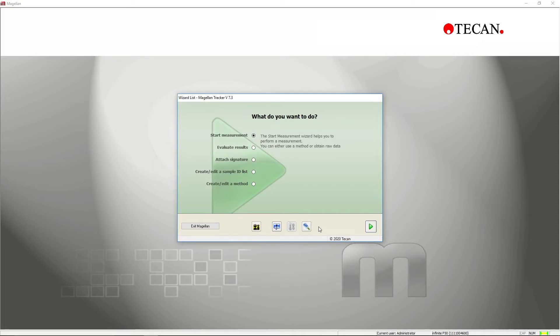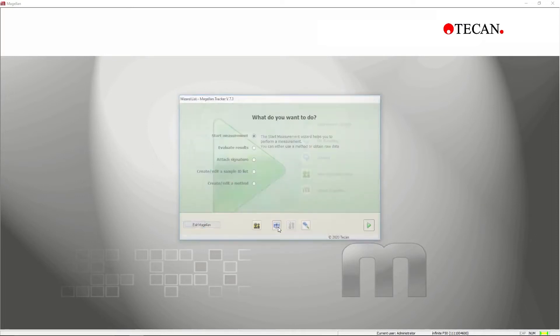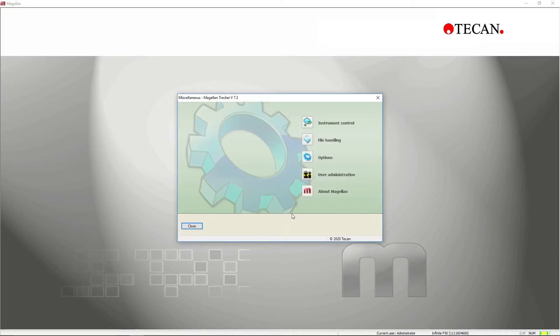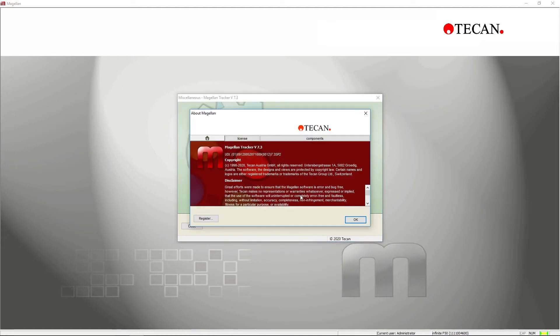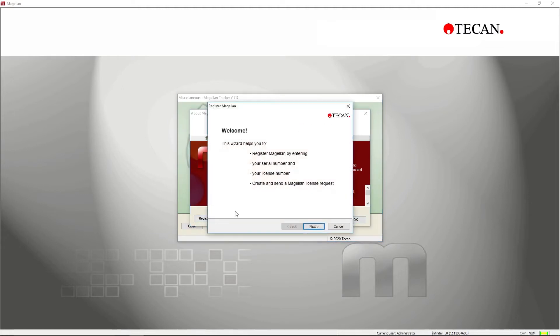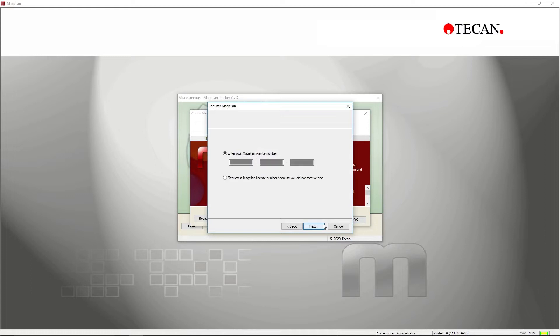Once you have received your license number from Teakon, open the registration wizard and enter the license number into the appropriate box. This completes your registration and permanently enables the software for that computer hard drive.